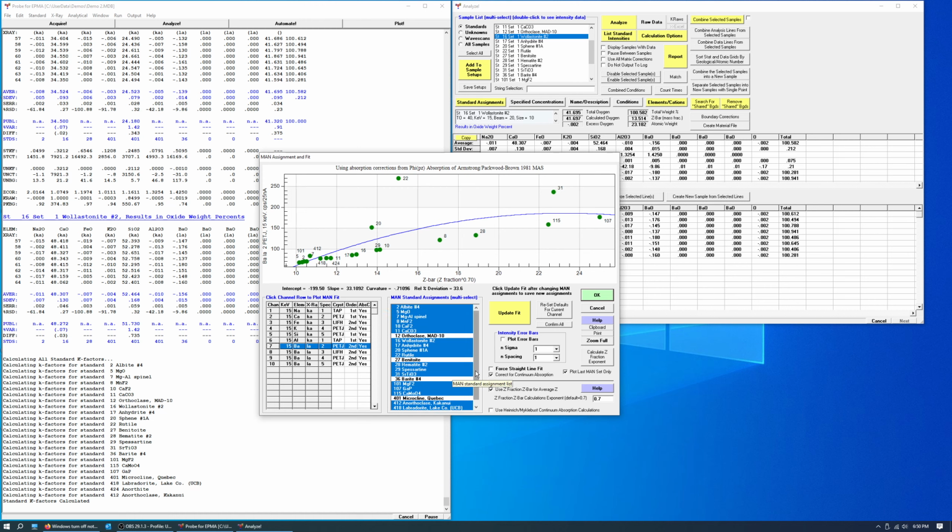But PFE can't deal with a barium contamination or content if it's not specified, and that often happens when we're measuring trace elements. Probe standards, generally speaking, have been characterized for their major and minor elements, and trace elements have not necessarily always been accounted for. So we may have barium that is not part of the standard database, even though the sample may contain that.